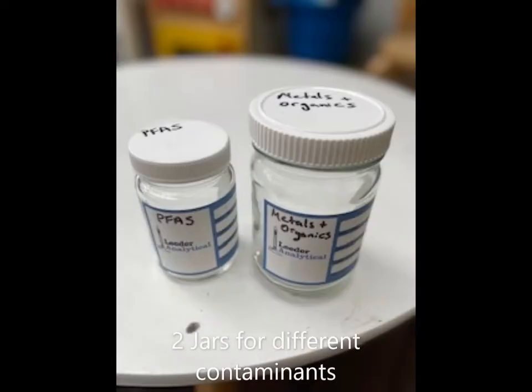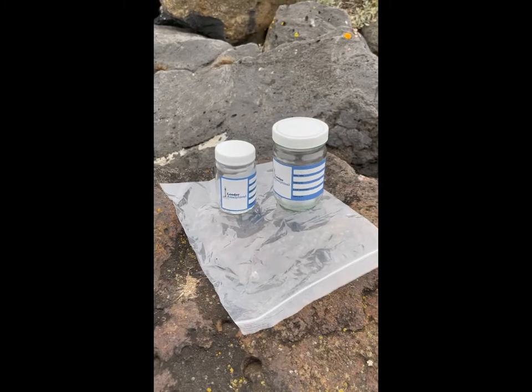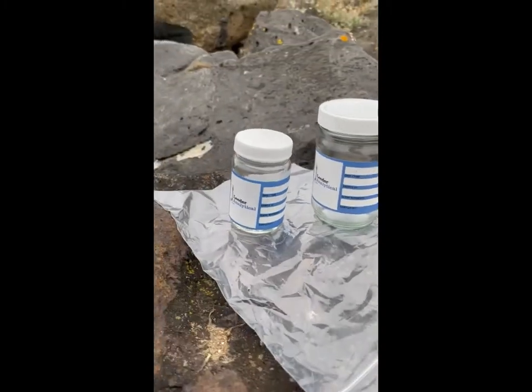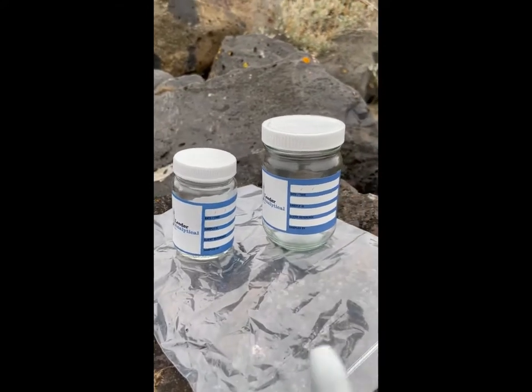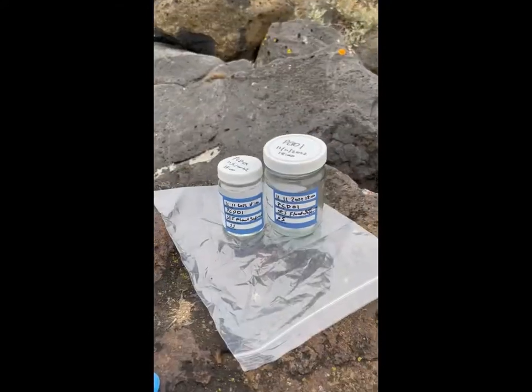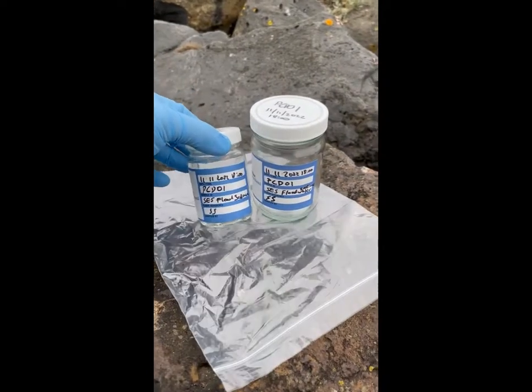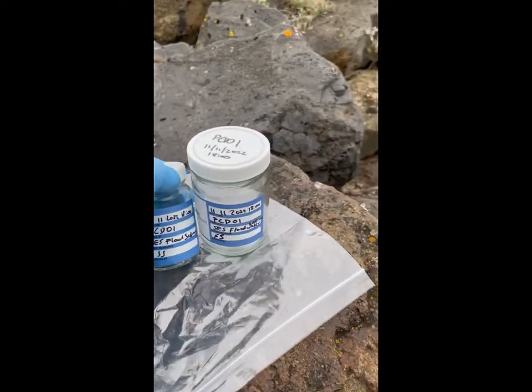We are going to collect sediment samples in two jars. Label the jars with the sampling code, site location, date, time along with your initials. After labelling the jars, use nitrile gloves to open the lid, taking care not to touch the inside of the jars.